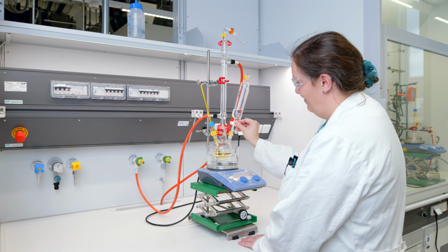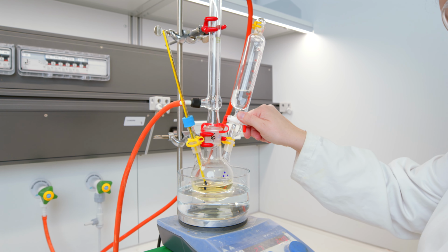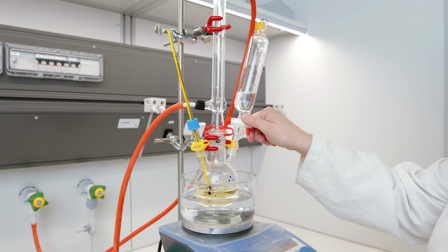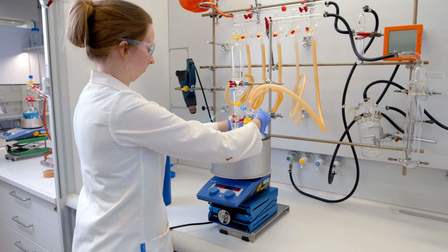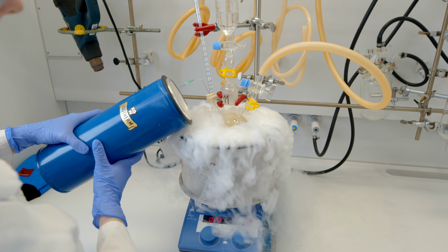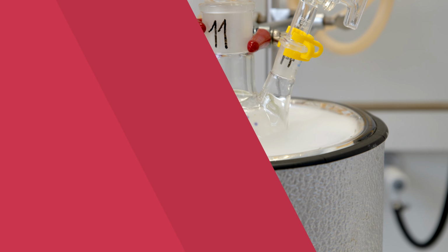Now let's look at this fascinating setup. That's the typical setup that you expect in any organic lab, where you boil liquids which react under different conditions while we're adding some other reagents. Some compounds are very air sensitive, and if you work with those compounds, you need to work under protective atmosphere. During our lab exercises, you will be prepared to handle those very sensitive compounds and work under protective gas atmosphere.